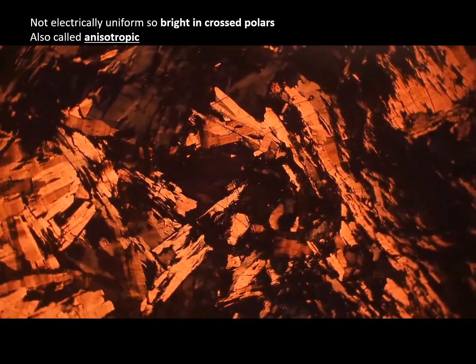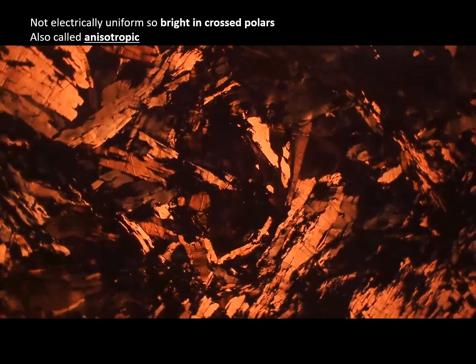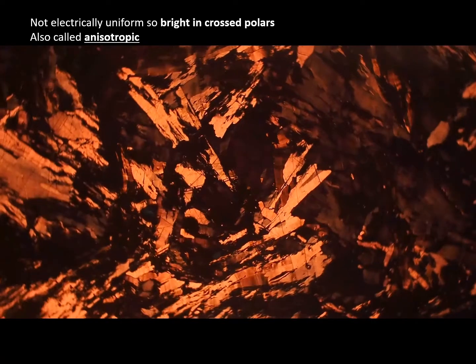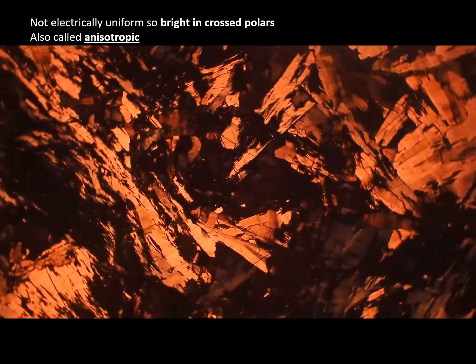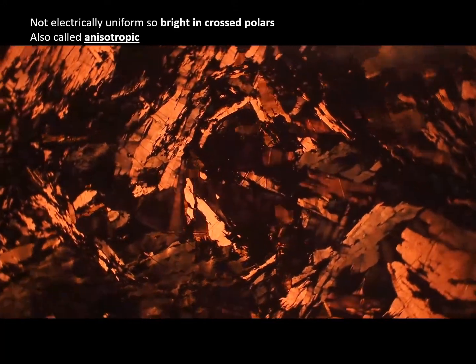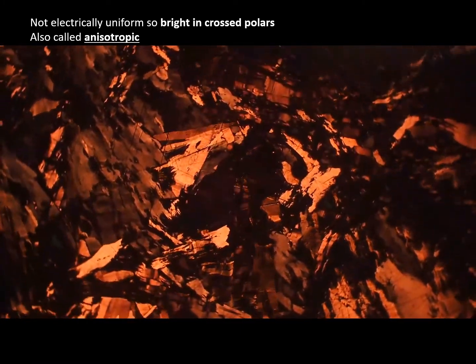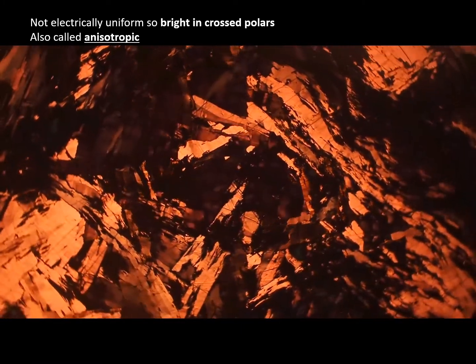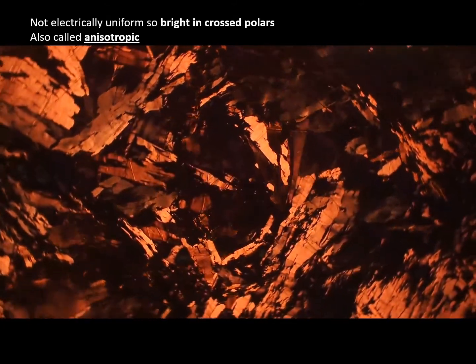As you rotate it, they're getting more yellow or orange, and then eventually going dark. And as we continue to rotate, it keeps coming up. So this is an example of an anisotropic mineral, and both the color of the anisotropy and the fact that it is anisotropic is indicative of this mineral, and we can use it to help us identify it.